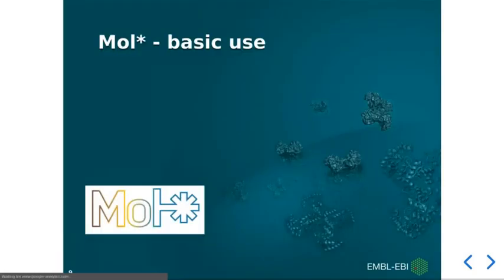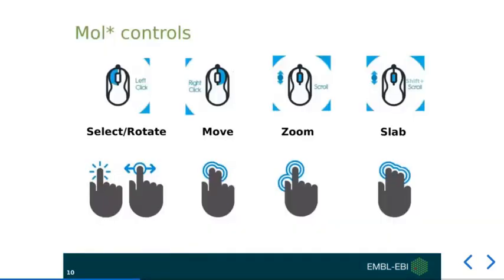So, let's look at the basic usage of Mol* and show you how to load a structure directly from a PDBe entry page. But just before, let's briefly run through the controls. Depending on whether you're using a mouse or a touchscreen device, the controls are as follows.